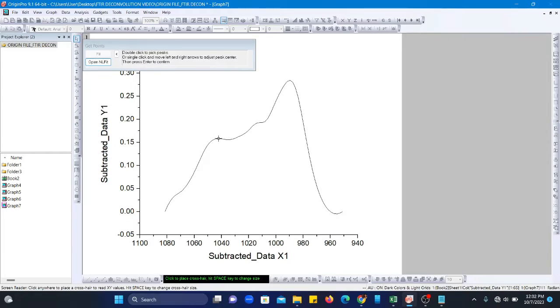For example, the alpha helix, beta structures, random coils. If these kind of secondary structures are present in your sample, then those peaks will be revealed after you deconvolute the amide region. For alpha helix and beta sheets, there is a particular range of wavelength between which the peaks will be shown, not beyond that particular region.